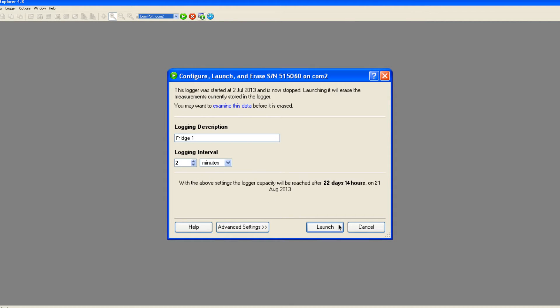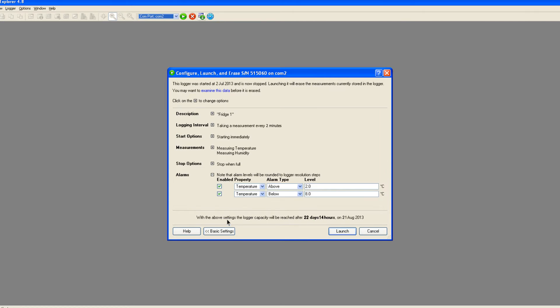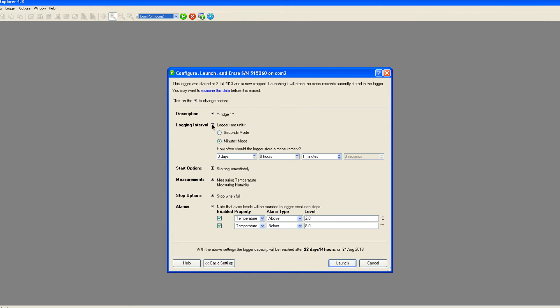The logger is now ready using these basic settings, but further options to suit specific requirements may be selected by clicking the advanced settings button.